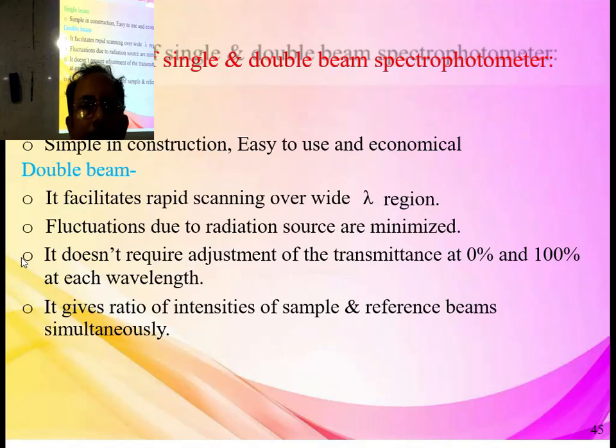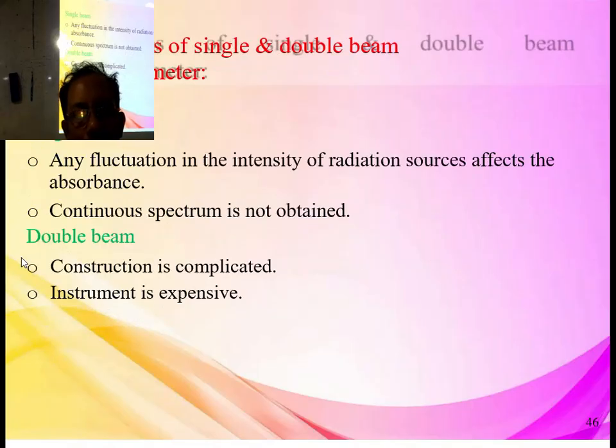Single beam is cheap, easy in construction, easy to use and economical. But double beam has a lot of advantages. So nowadays, single beam is obsolete. Everyone is using double beam.